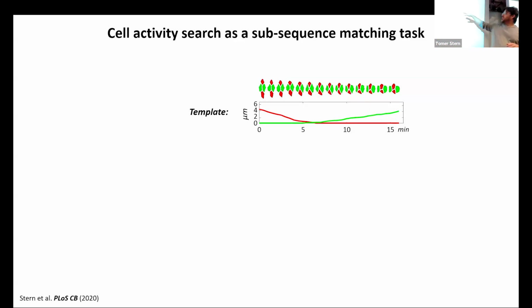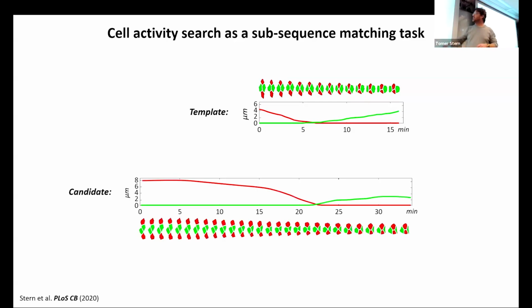Right. So now, the algorithm will convert all the quartets in the embryo into time series. And now we have a multi-dimensional time series search problem, which is something that you guys do in sequence analysis. It's a 30-year-old problem, 40-year-old problem. One way to solve that is simply a sliding window, searching the Euclidean distance between the 2 sequences. But the problem is that it's not exactly like DNA. Rosettes can be slower, they can be faster, they can be first slow and then fast. We need something that would allow time to stretch when we're matching this pattern.